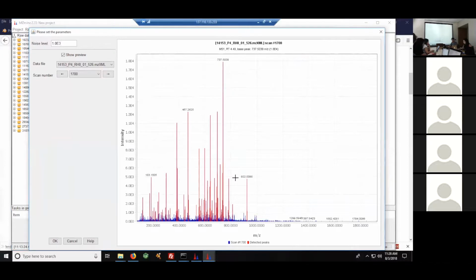The threshold that I establish will depend on my data set, right? Yes, exactly. And this depends most strongly on the machine you use, because machines have different generic intensity values. For example, between the QTOF we have here and the Orbitrap we have, there's about 2 orders of magnitude difference. That doesn't mean that one is more sensitive, it just has a different value.